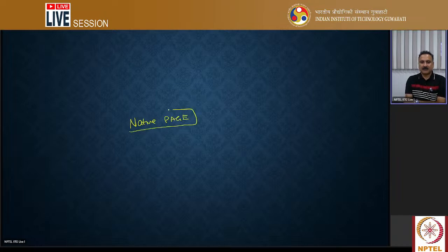I think we discussed the native PAGE, and you can also use another type of approach, which I think we also discussed, right?